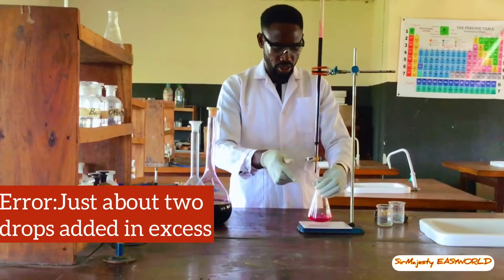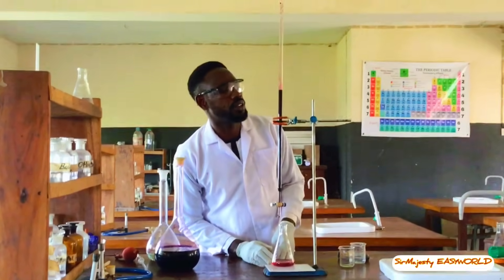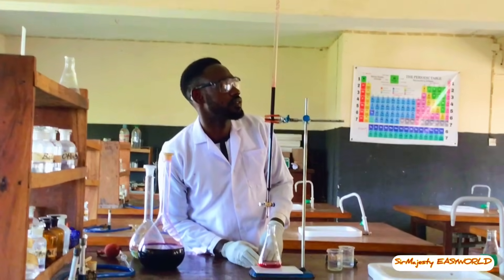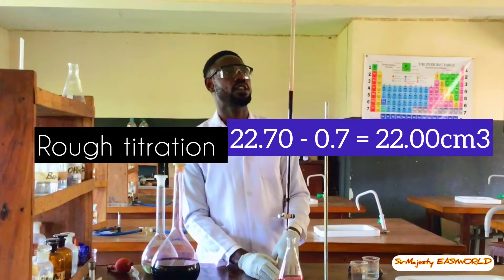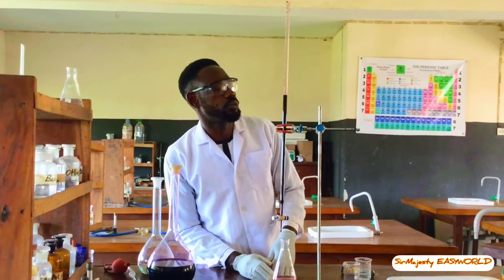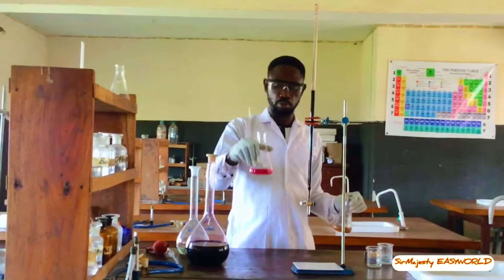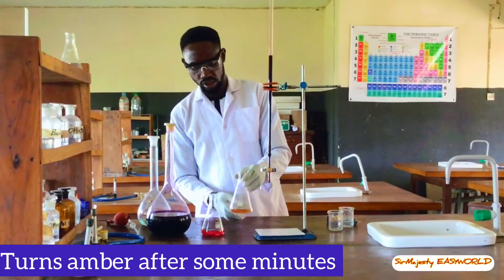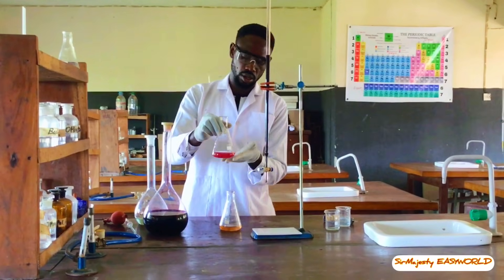We are at the end point — this pink color is the end point color. Our reading here is 22.56, approximately 22.7. Our initial was 0.7, therefore the volume of KMnO4 used is 22.7 minus 0.7, which equals 22.0 mL. This color change at the end point is manganese 2+ mixed with iron 3+, but on standing it will turn yellow. This is the titration mixture — after some minutes this color will reverse.